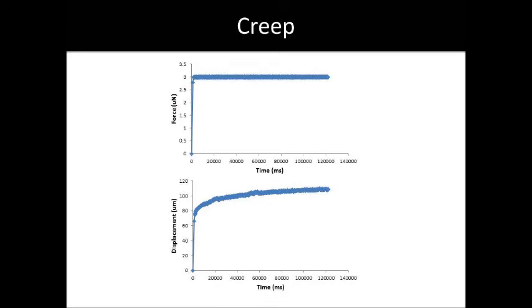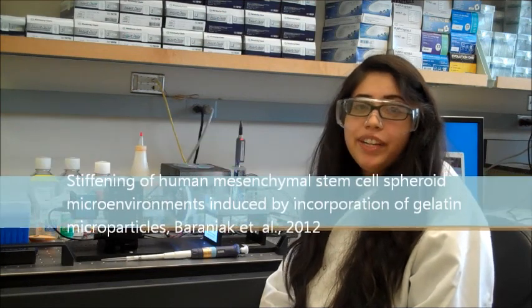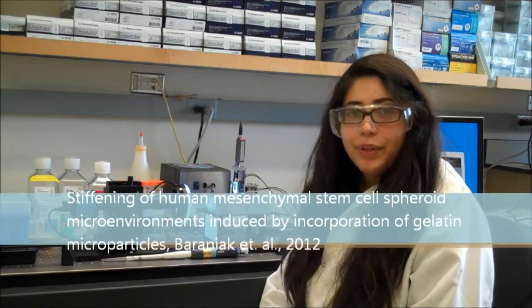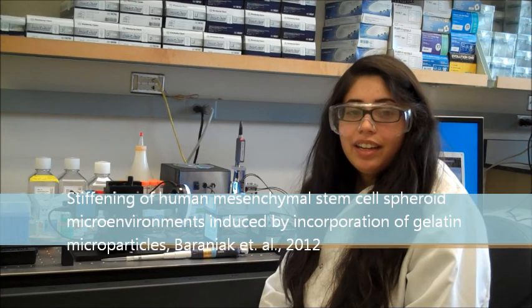So I understand you've been using the micro squisher for some time now. Have you been successful in collecting data that has enabled you to learn new and interesting things and start to put together data that's useful in publications? The McDevitt Lab has had the micro squisher for about a year and a half now. And in that time, we already have a publication by Dr. Priya Baraniak that demonstrates how microparticle incorporation stiffens spheroids of mesenchymal stem cells. With the help of the micro squisher, we will certainly have at least one more publication on the mechanical properties of stem cell aggregates in the near future. So stay on the lookout for another McDevitt Lab publication.